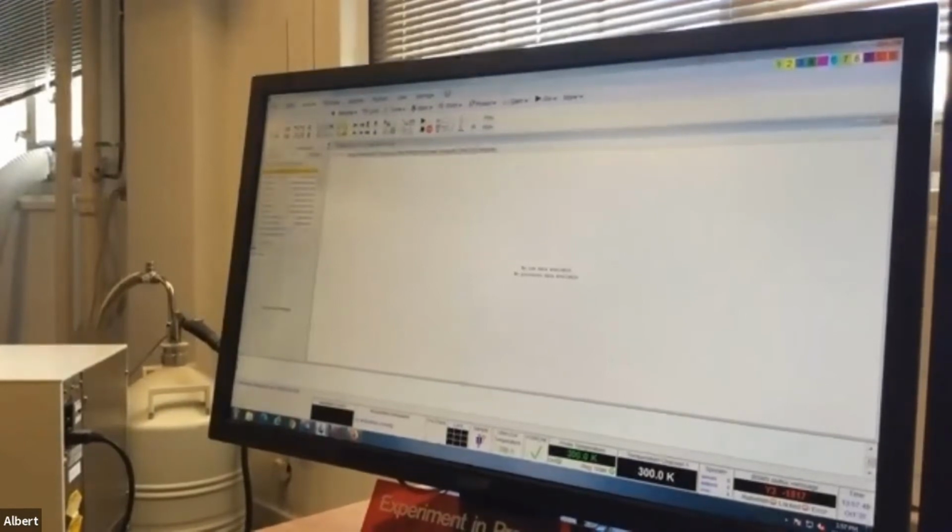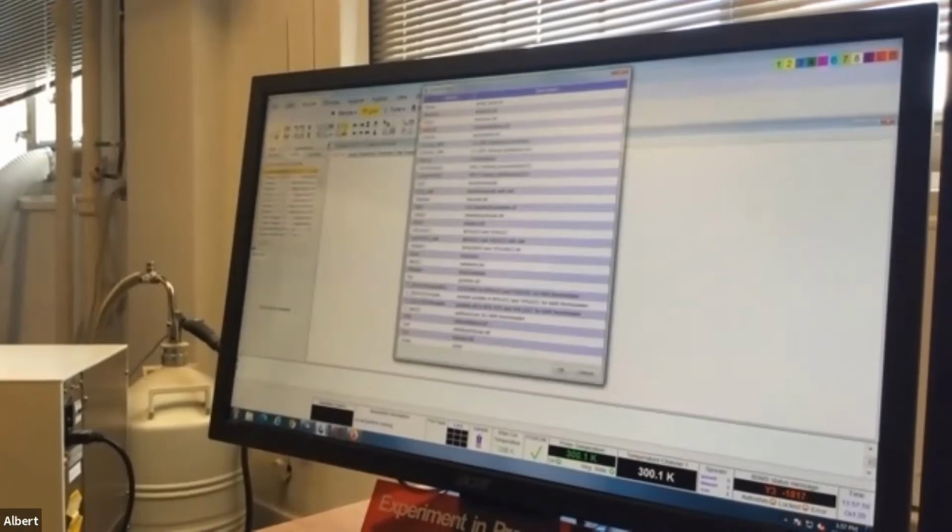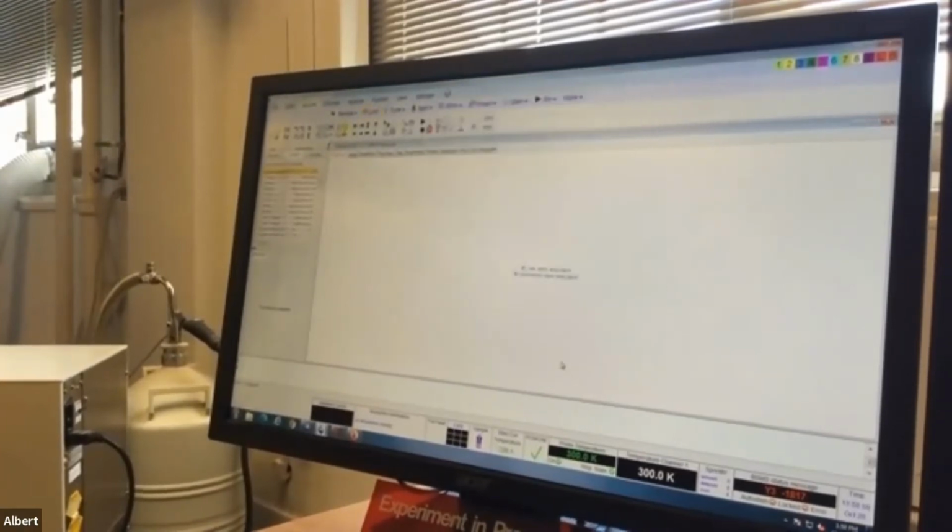You'll hear a click. All right. So now click lock, my bad, and find the solvent. And click OK. The same commands are down here. You want to find the deuterium, lock onto it, and it's going to tell you either done, succeeded, or finished.